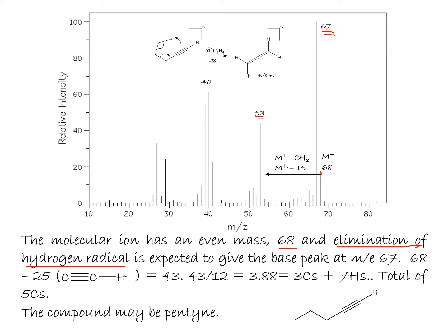All right, now we have molecular ion at 68. We have this part of 25 mass. The rest, R, will be of mass 43.